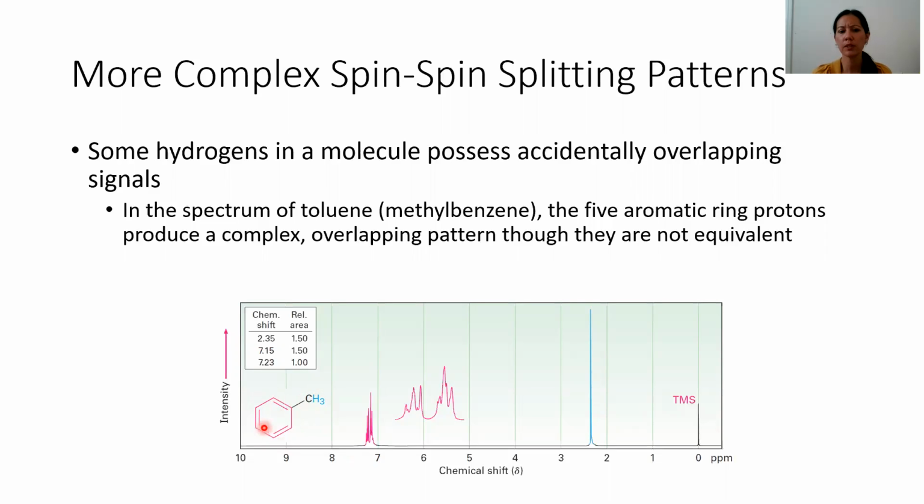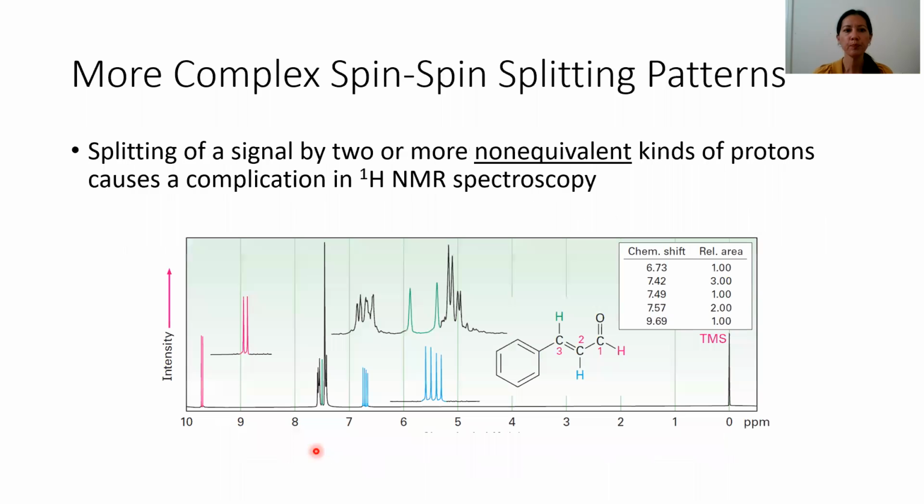If you have another substituent here in the 4 position, then you get more symmetry. So when you do have a little bit more complexity, you can use that to your advantage sometimes, to unravel and confirm the identity of a structure or allow for a structure determination.